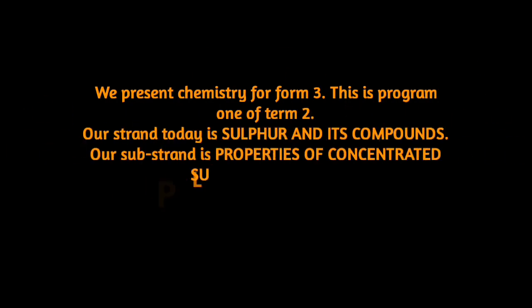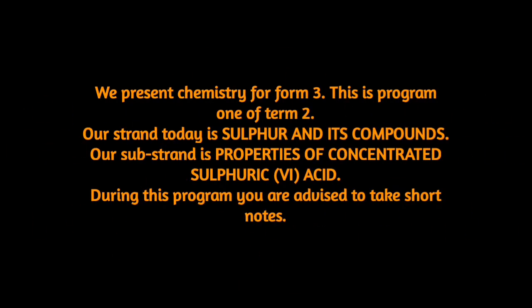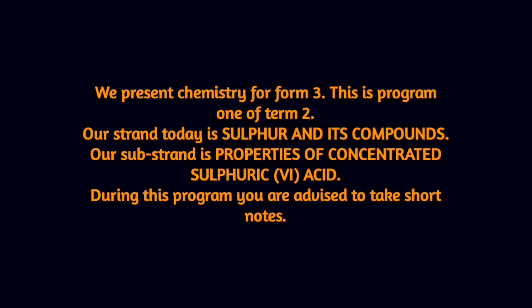We present chemistry for Form 3. This is Program 1 of Term 2. Our strand is sulfur and its compounds, and our substrand is properties of sulfuric acid. During this program, you are advised to take short notes.